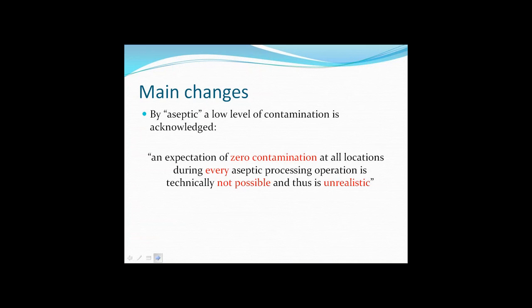In looking at aseptic filling, it's also important to note, and this is a useful thing to bear in mind when having regulatory inspections, that the chapter is not unrealistic in the requirements in relation to levels of biocontamination.